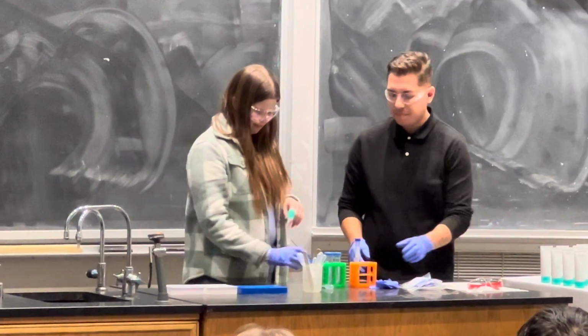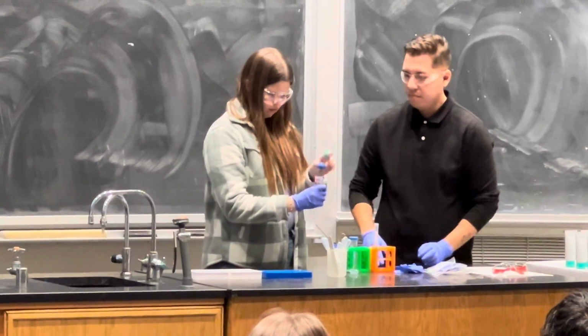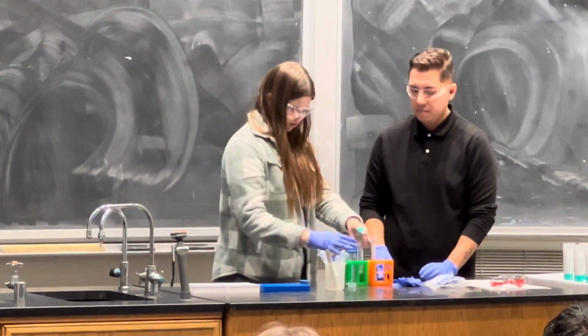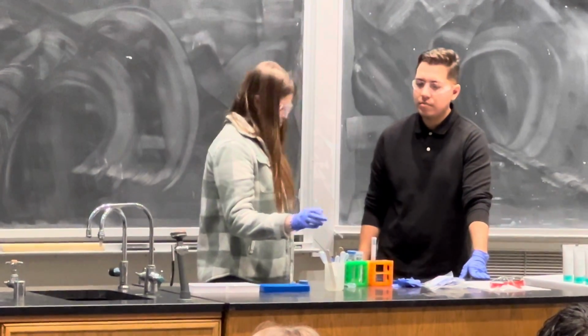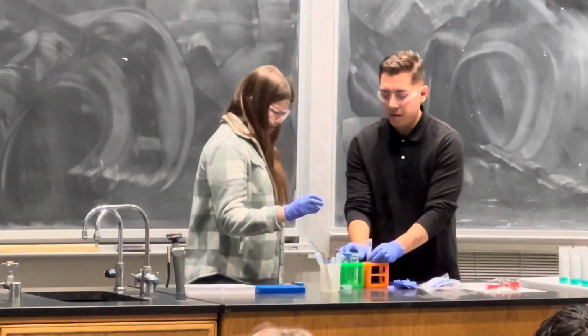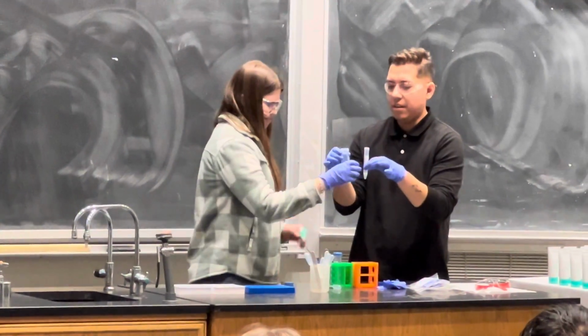Okay, now you're going to fill to the 13 milliliter mark with your isopropyl alcohol. And we're going to have her shake it, but normally you would shake it and then you would also place it in an ultrasonic bath, if you want, to promote the extraction, but we don't have that today, so we're just going to pretend that we do the extraction.